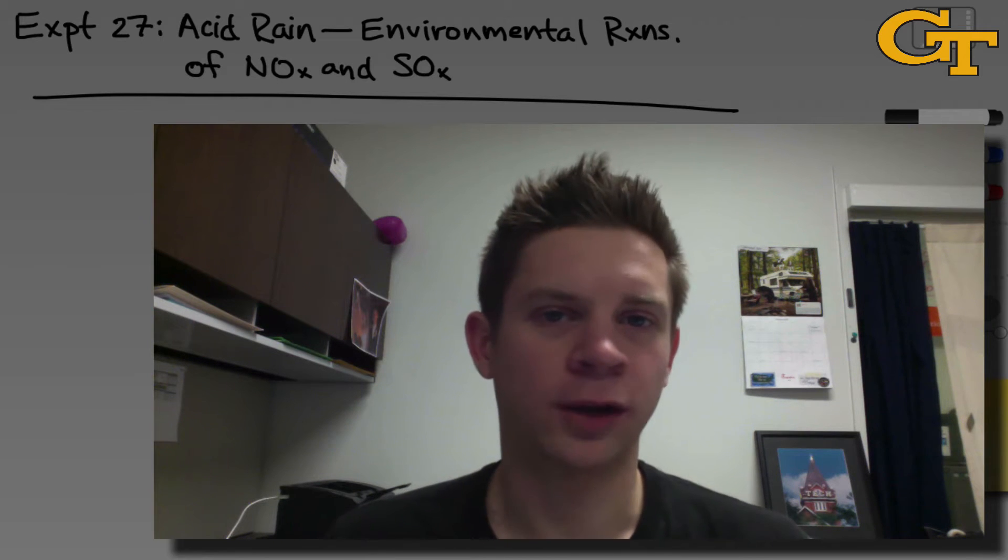Experiment 27 in Chem 1212 is titled Acid Rain, Environmental Reactions of Nitrogen and Sulfur Oxides. The big idea of this experiment is to generate these oxides inside a petri dish, which we're going to use as sort of a mini-environmental chamber, and to observe their effects on rainwater.